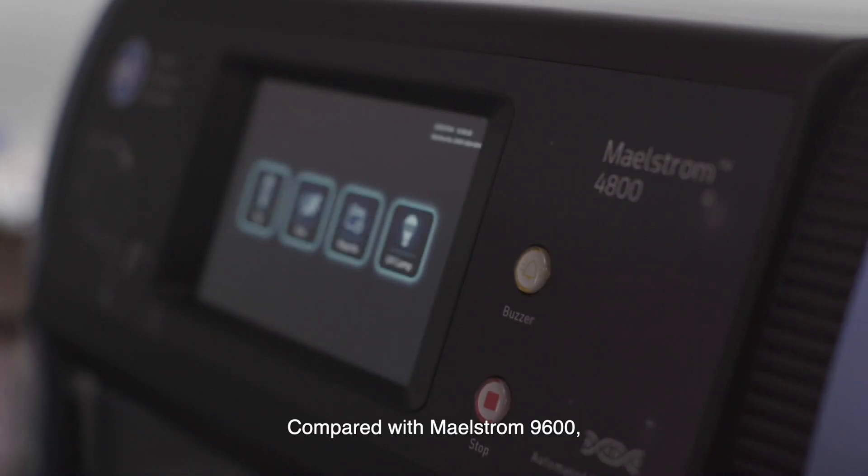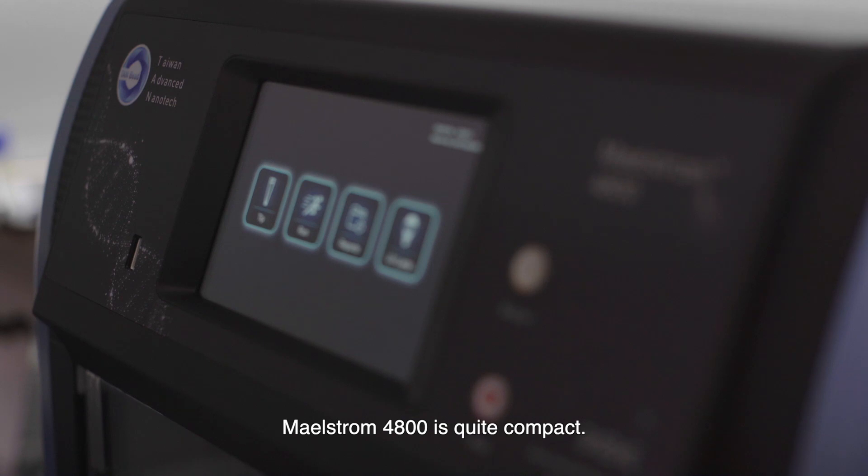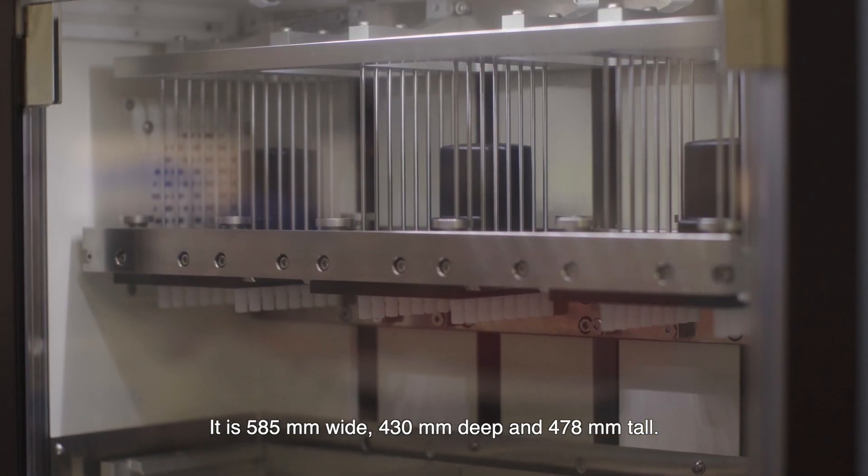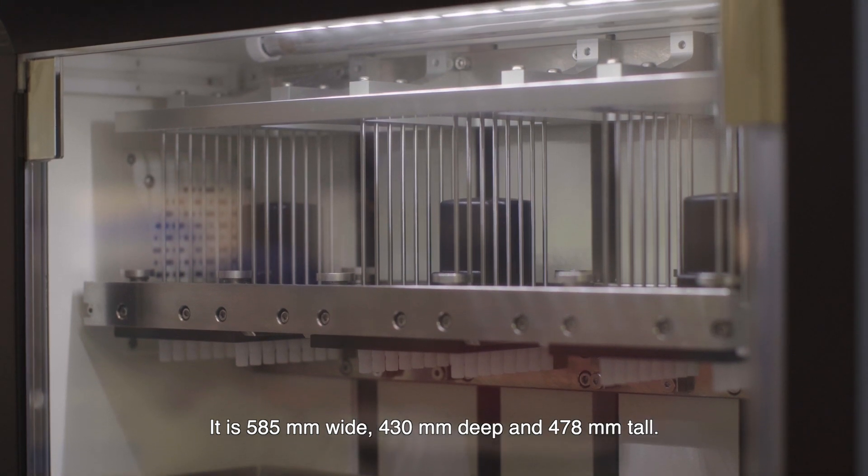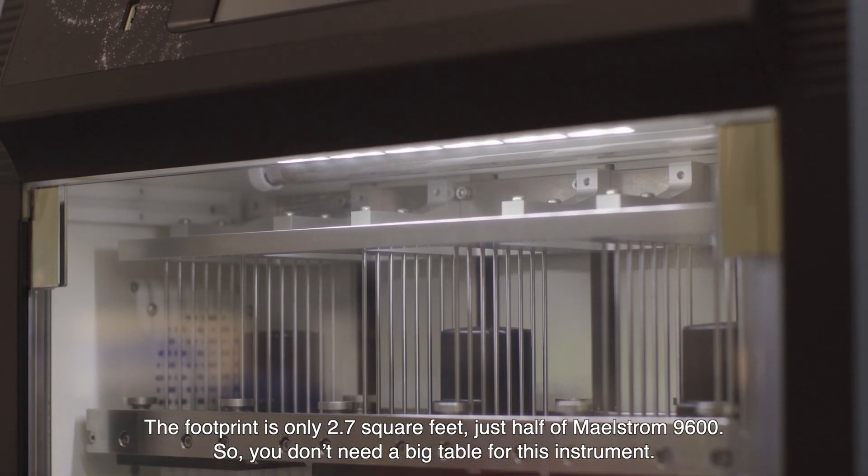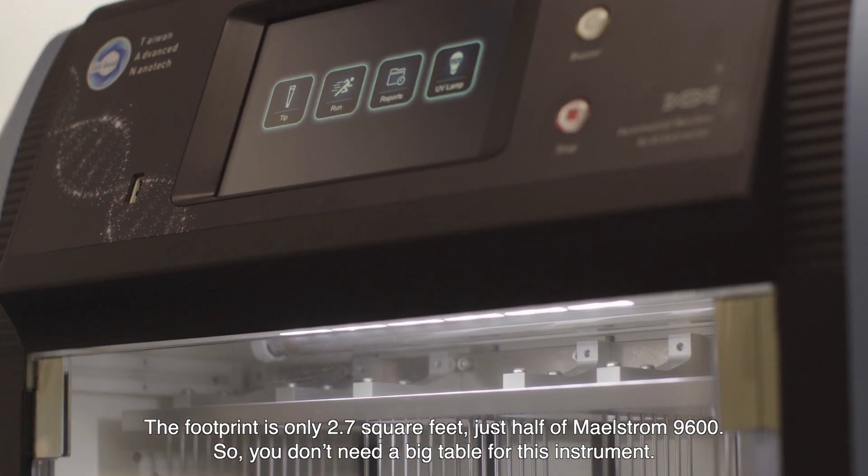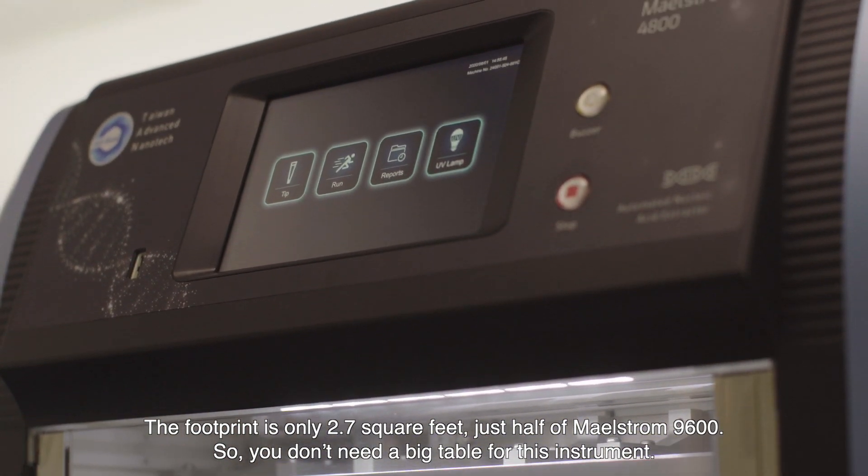Compared with Maelstrom 9600, Maelstrom 4800 is quite compact. It is 585 millimeters wide, 430 millimeters deep and 478 millimeters tall. The footprint is only 2.7 square feet, just half of the Maelstrom 9600, so you don't need a big table for this instrument.